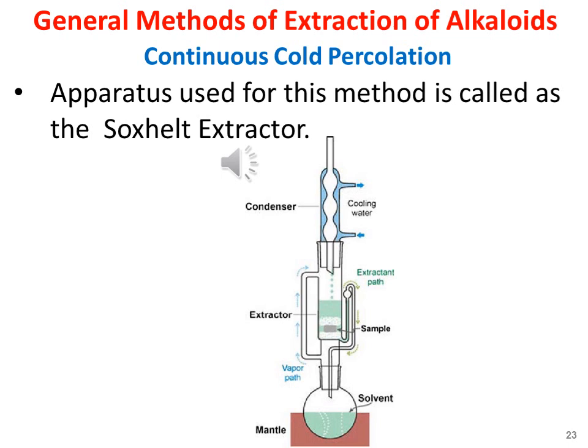Mostly the continuous cold percolation method is used. The apparatus used for the continuous cold percolation method is called the soxhlet extractor. The soxhlet extractor is shown on this slide.